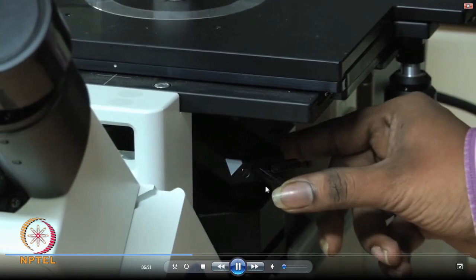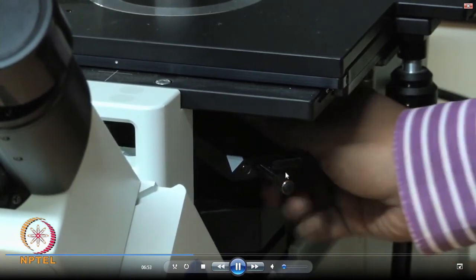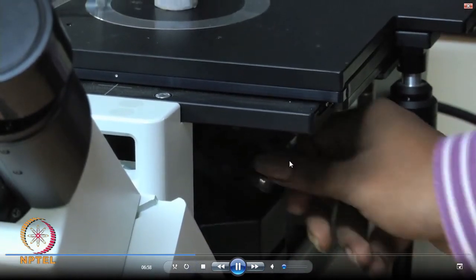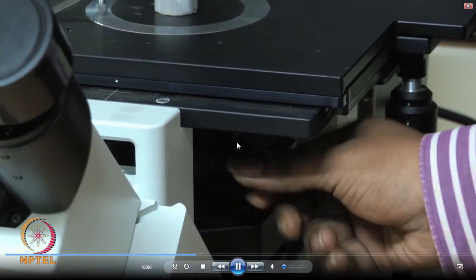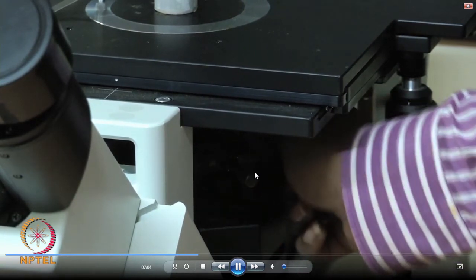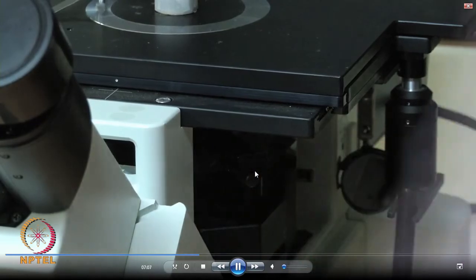You can see that you have this DIC prism, or Nomarski prism, or modified Wollaston prism, which can be inserted into this optical axis, and then you can see that there is an adjustable screw.